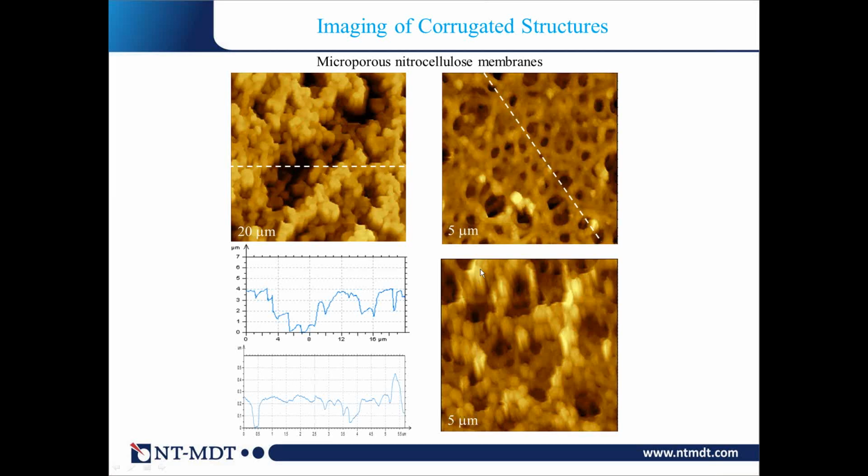You see the structures lean on one side and they repeat themselves, and that is due to the convolution of the tip with the structure which has these holes. If you have a much sharper tip, and you can find from different manufacturers tips with opening as sharp as 9 to 10 degrees, then you can easily show the topography which reflects the structure much more truthfully.